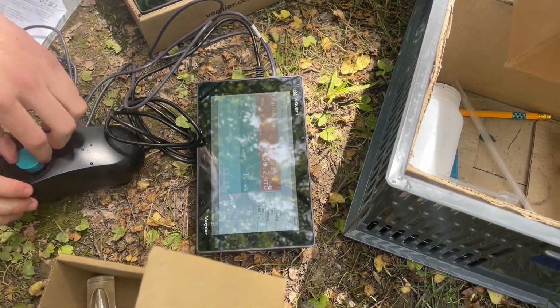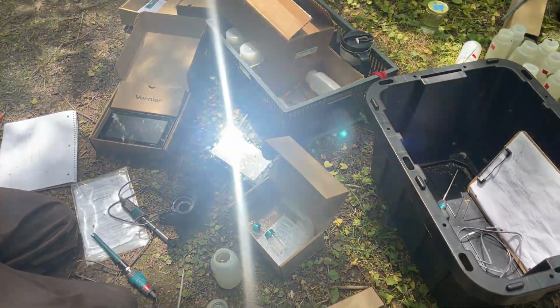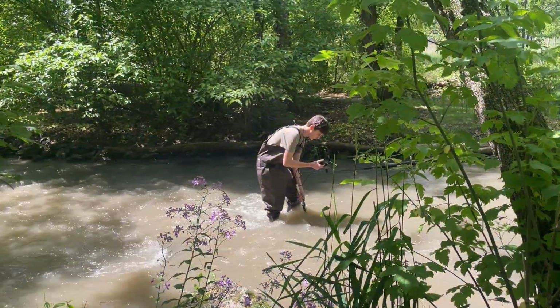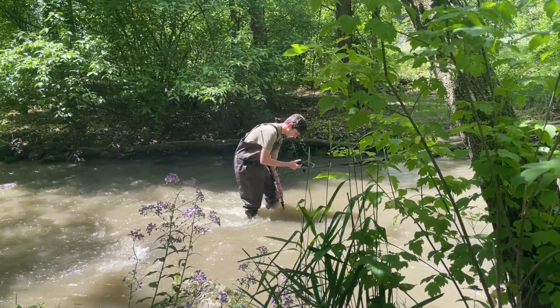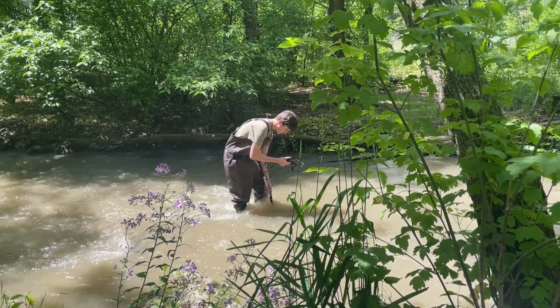Here's how to calibrate and use the new probe. These directions are the same for nitrates and ammonium. So 30 minutes before use, the probes must be soaked in 100 ppm solution in the short-term soaking bottle. When you are ready to calibrate, choose 2-point calibration on the LabQuest and let the value on the LabQuest settle before entering 100. Then click Save.